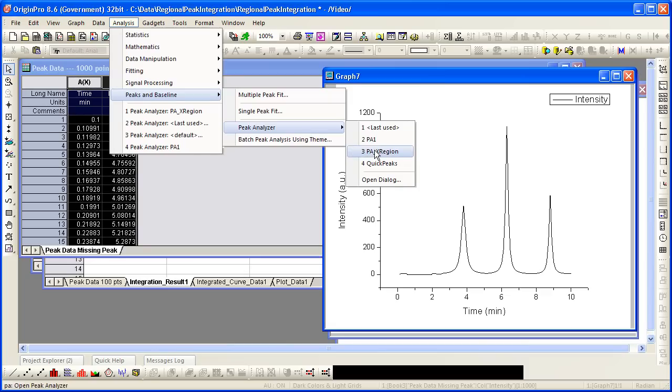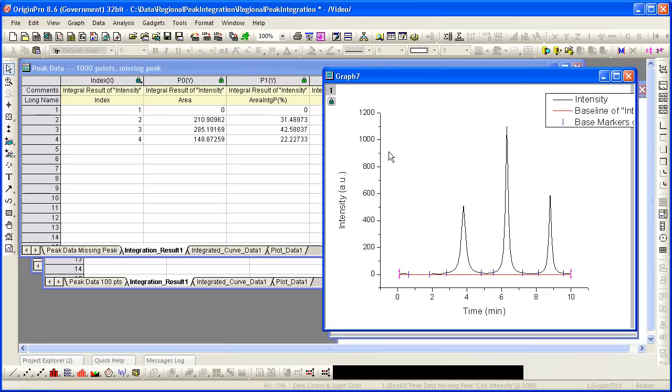Again, select peak analyzer, select the same theme, and indeed you see the markers are there, the peak is gone, the markers appear for the other peaks.